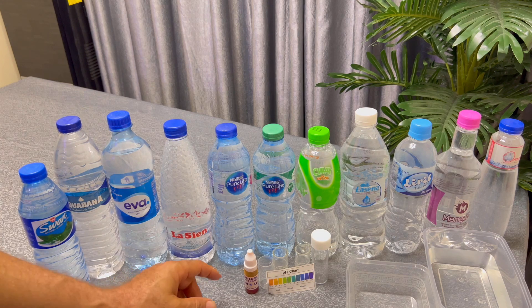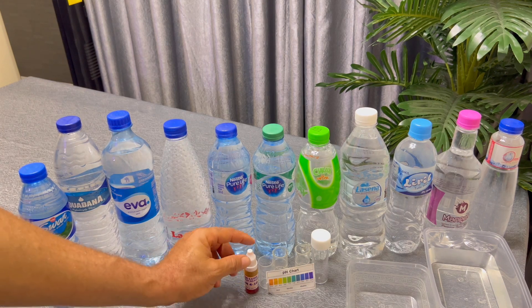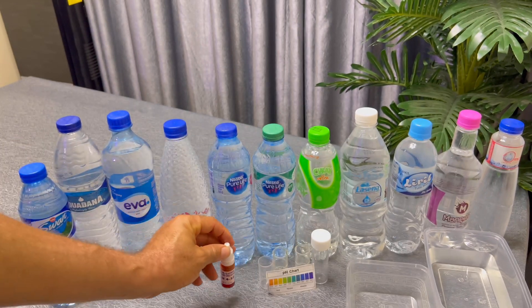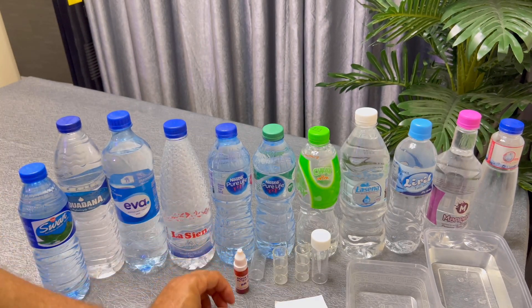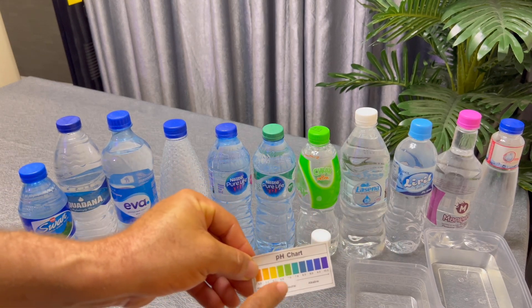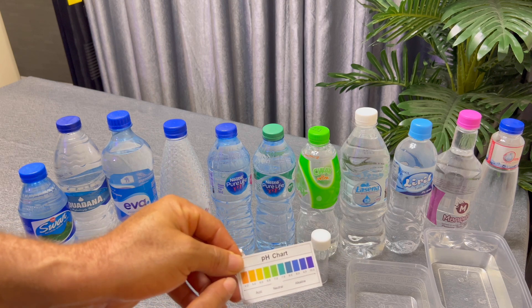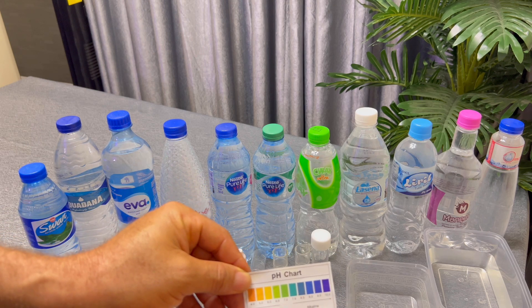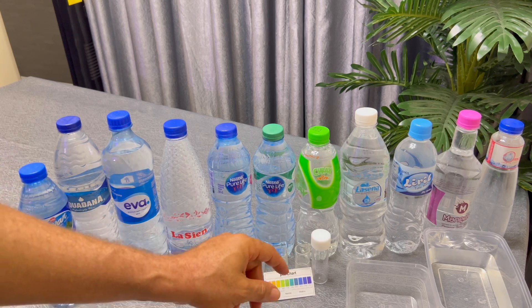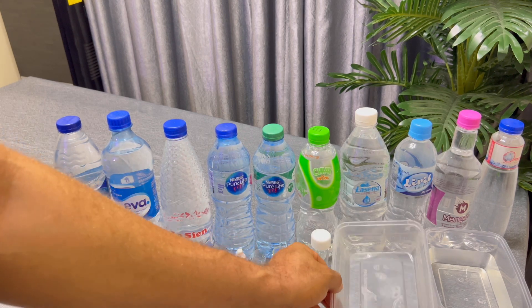We are diving straight into the practical section. We have the liquid tester, our test tube, and our pH chart. Whenever we test any water we'll bring it to this chart to see if it is acidic, alkaline, or neutral. We also have an empty container where we'll be disposing of each test sample, and we rinse the test tube before each new test.